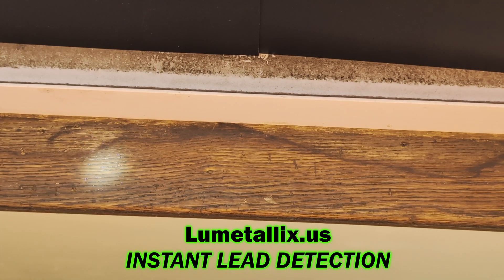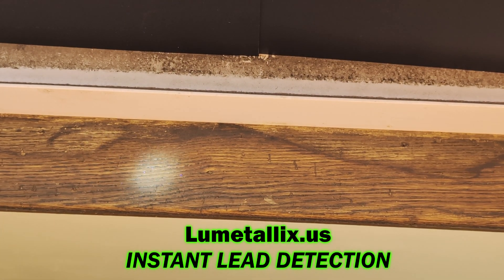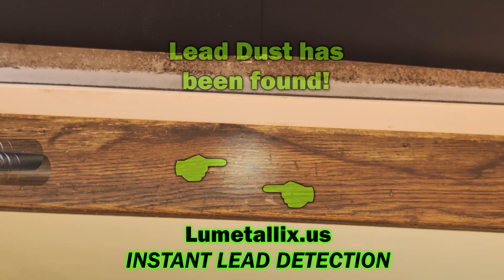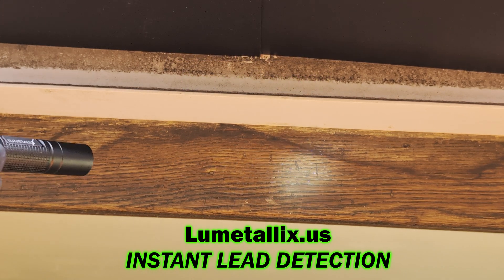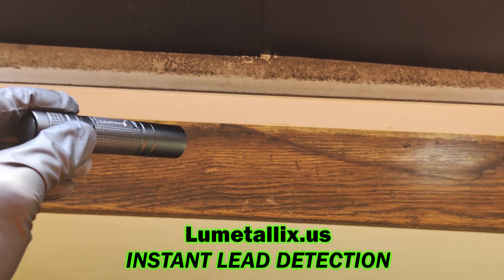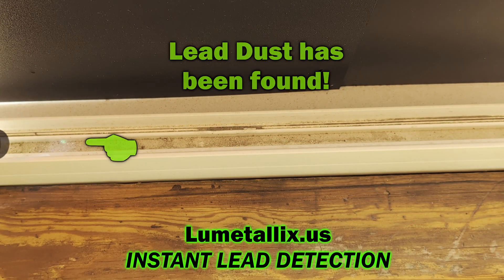On film, it's a little hard to see the glowing green, but in real life it's obvious. I found some lead dust here, and here's where I found some more lead dust. And I found some lead dust here as well.